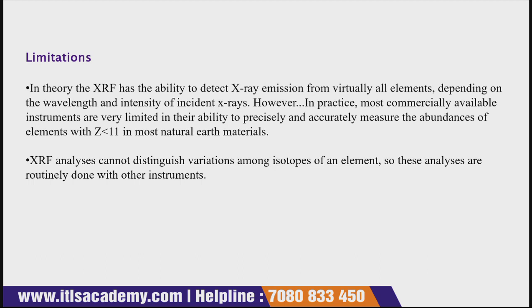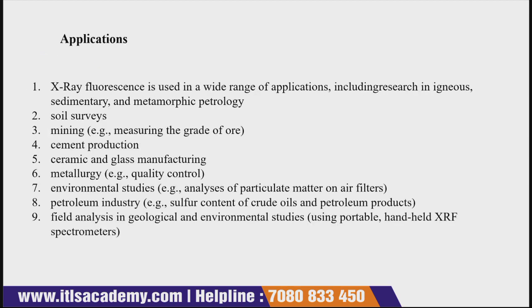It also cannot distinguish between various types of isotopes of elements. So if you want to distinguish the variation among the isotopes of an element, this cannot analyze that. These analyses are routinely done with other instruments. So these are certain disadvantages.